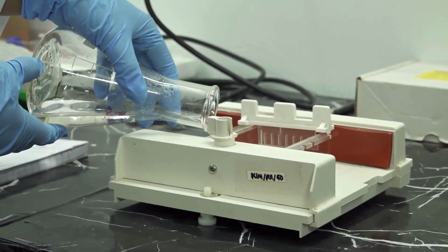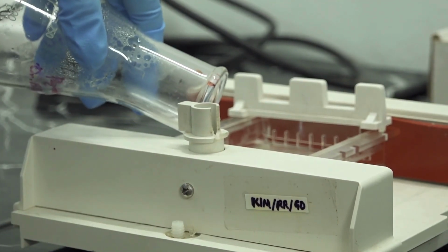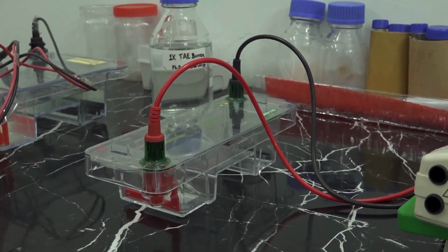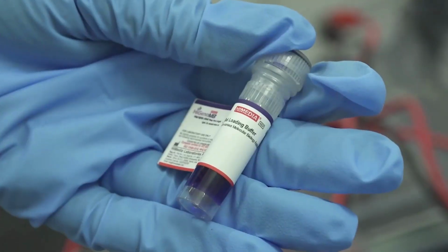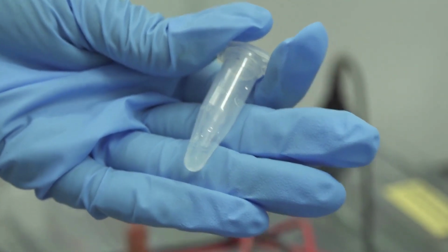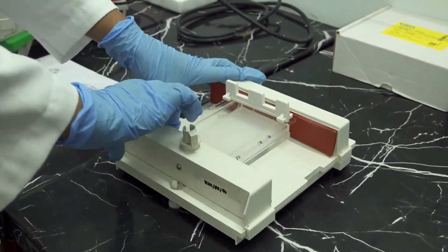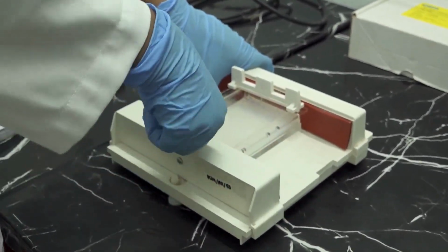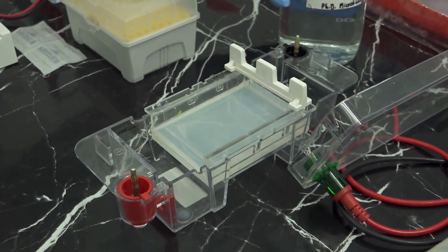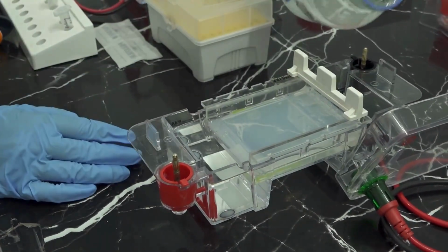Pour the agarose into a gel tray with the well comb in place. Once solidified, place the agarose gel into the gel box, the electrophoresis unit. Fill the gel box with 1x TAE until the gel is covered.